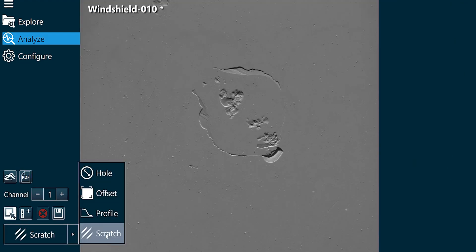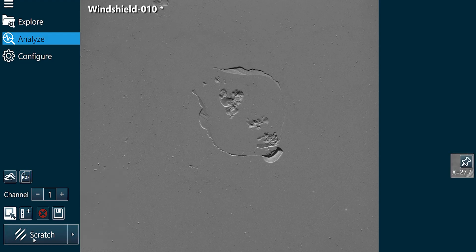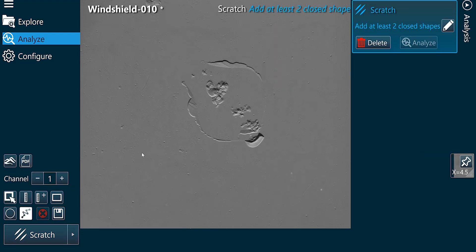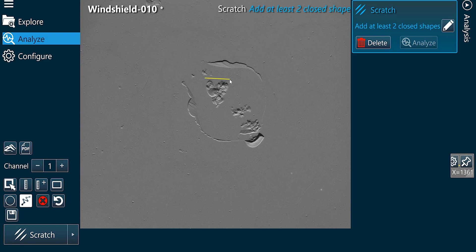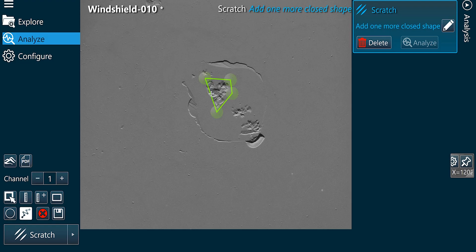We will record the depth of the defect in the glass surface. First, draw a shape around your scratch — in this case, with the Polyline tool.